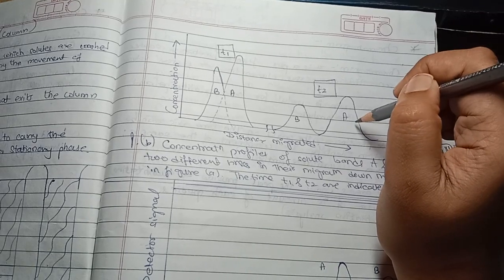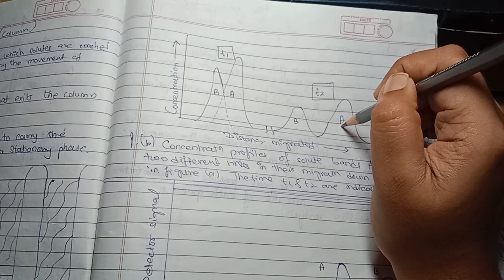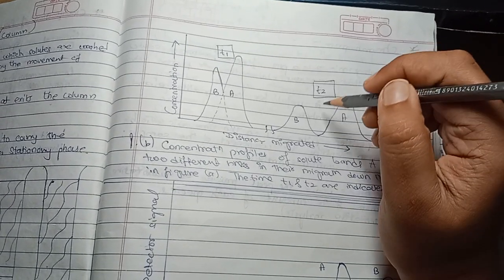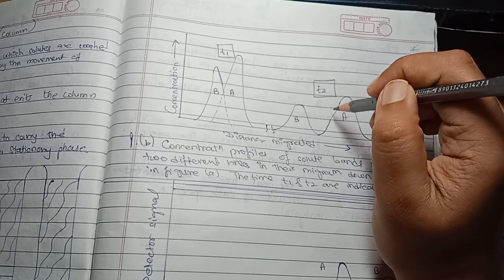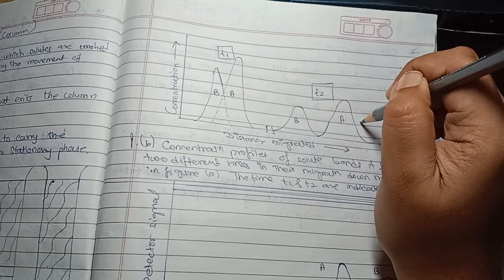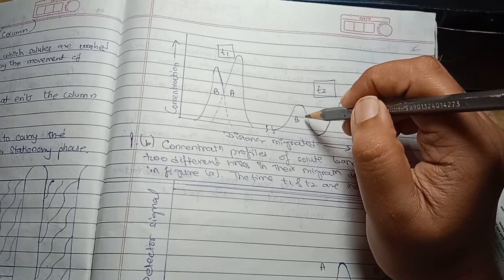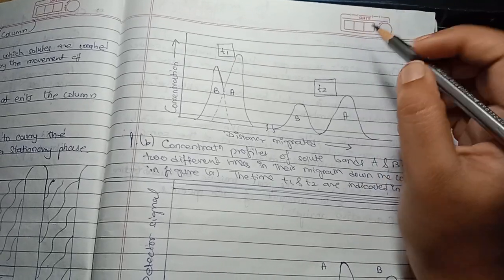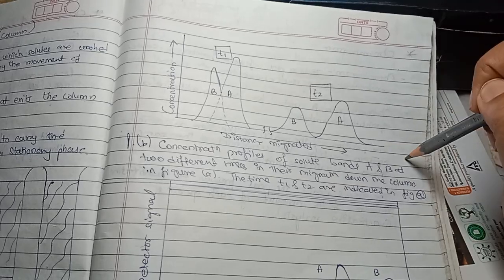Here we can see that component A will move out of the column first. Once the concentration of A has completely come out of the column, afterwards the B component concentration will come out of the column successfully.